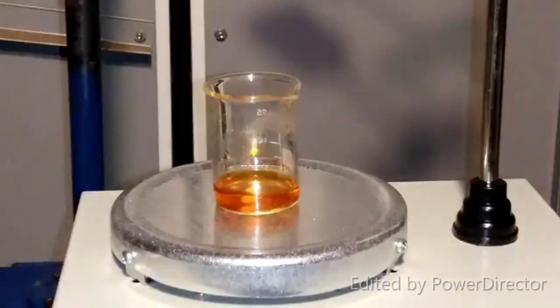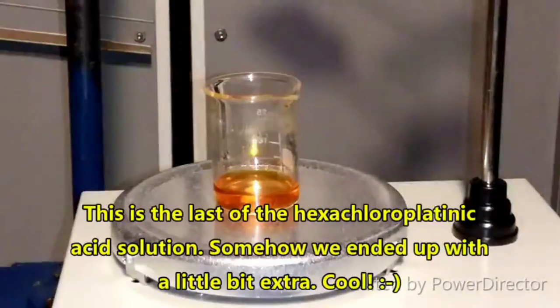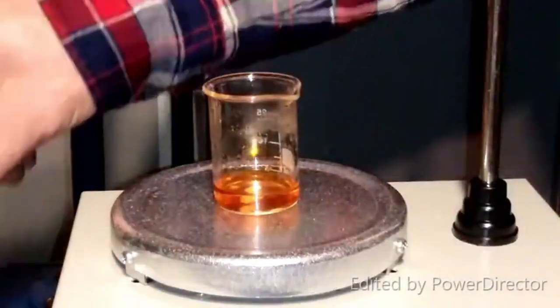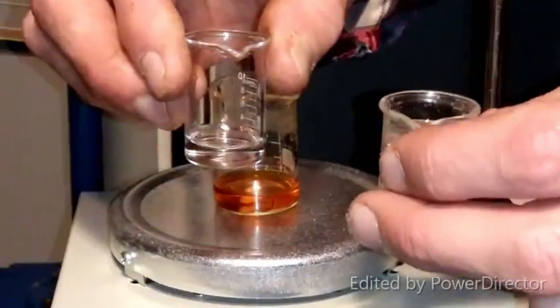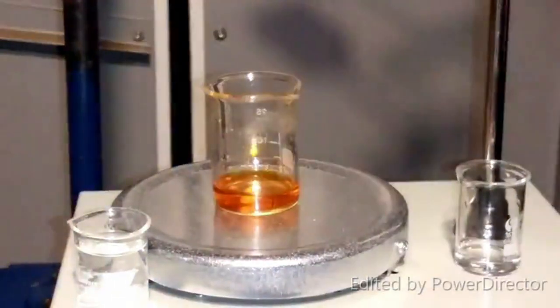Alright everyone, it is time for the next platinum compound, which is going to be platinum triselenide. I've got 1 mL of our solution here. It looks like it's a little bit more than that. I don't know how that worked out, but okay. What I've got here is a solution of potassium chloride, potassium hydroxide, and potassium selenite. It's just a clear solution. There's nothing really to see with this. It's the same solution. It ended up being in two beakers because it was just so small once I combined it. And I think that the order that we add things into this is important.